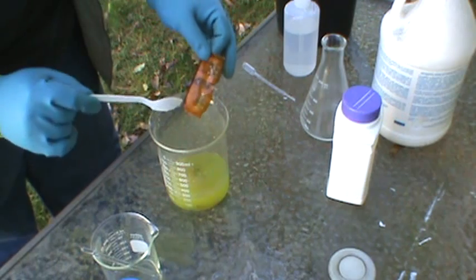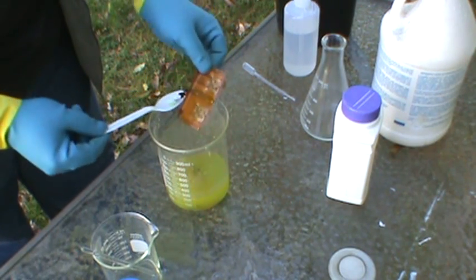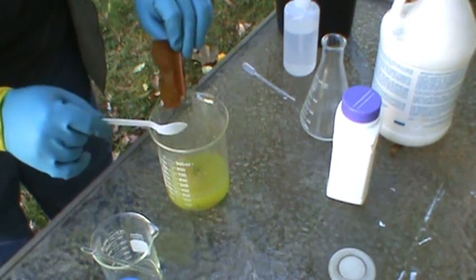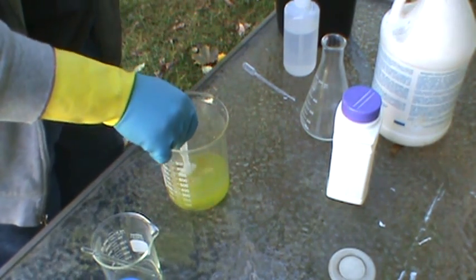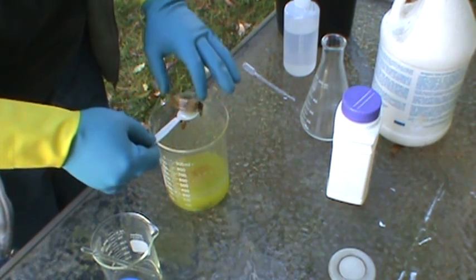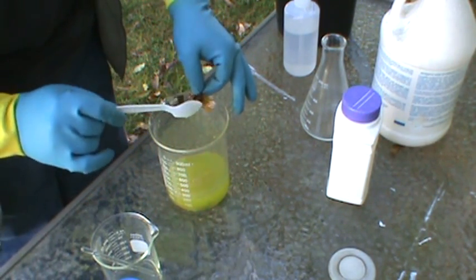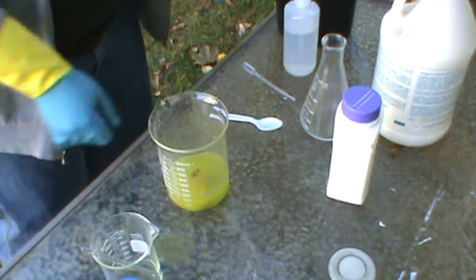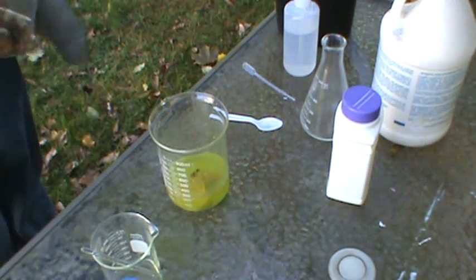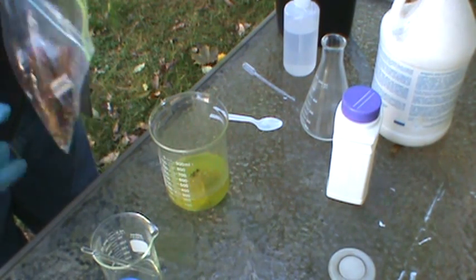So when you pull them out, if you look at it, you'll see that there's no more gold color on there. That means the gold is now in the solution. I'm going to put these in a bucket over here; I'm going to be rinsing them one more time before I toss them out. You see all the gold on the back is gone, and it's just about all gone on the front one. Just a note that there's 25 grams of foils here.